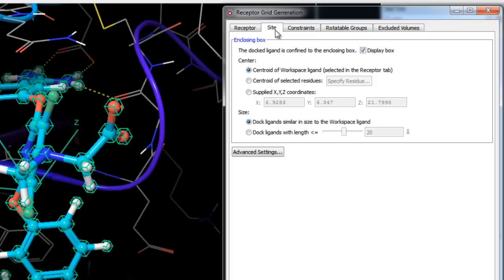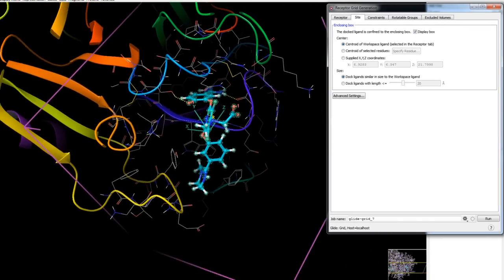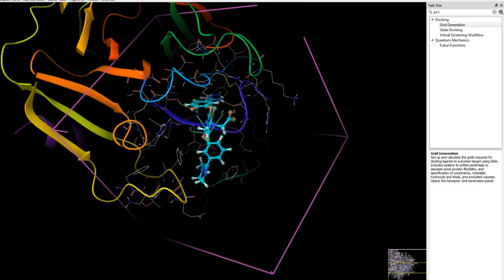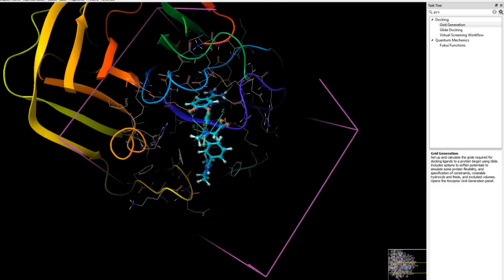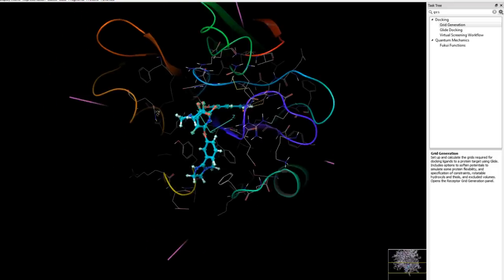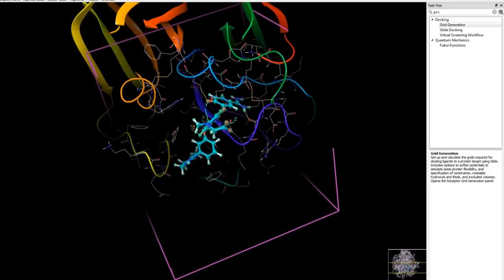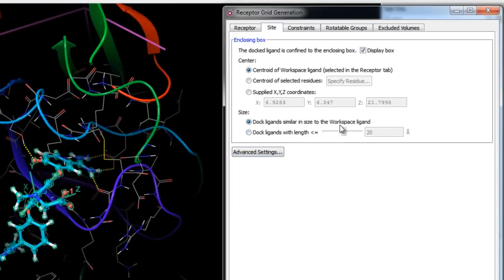Now that the ligand has been excluded, we can proceed to the Site tab to define the active site volume for which grids will be calculated. These settings determine where the scoring grids are positioned. The purple enclosing box, representing the volume of the protein for which grids will be calculated, is automatically defined by the centroid of the ligand selected in the receptor tab.